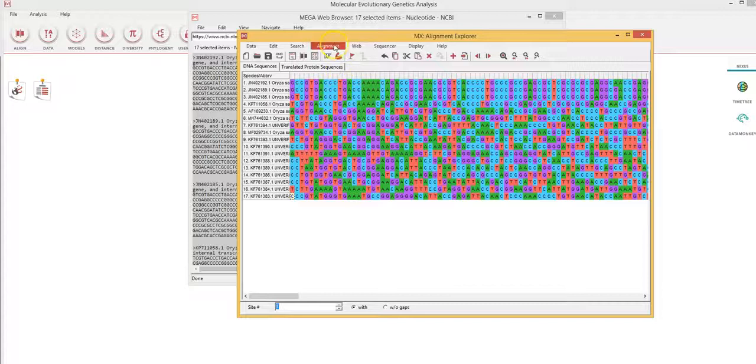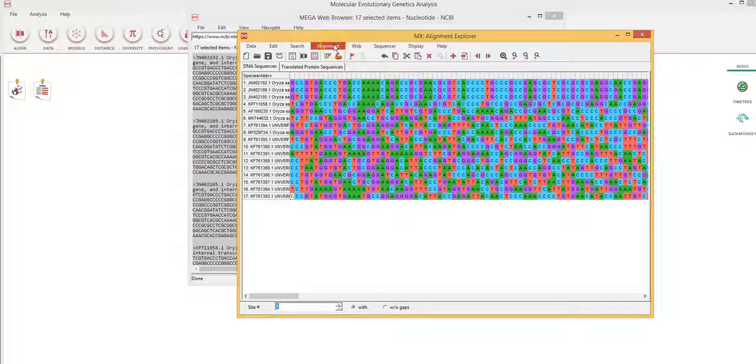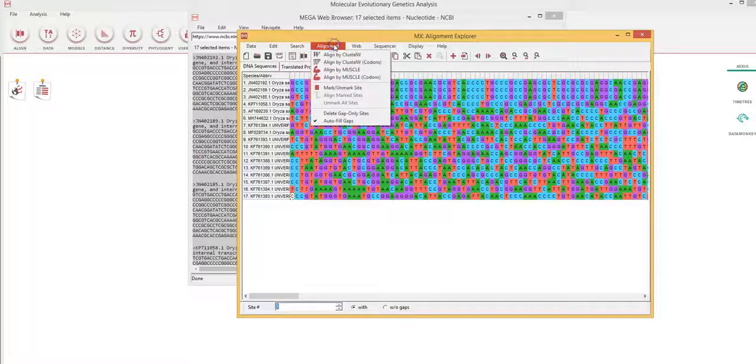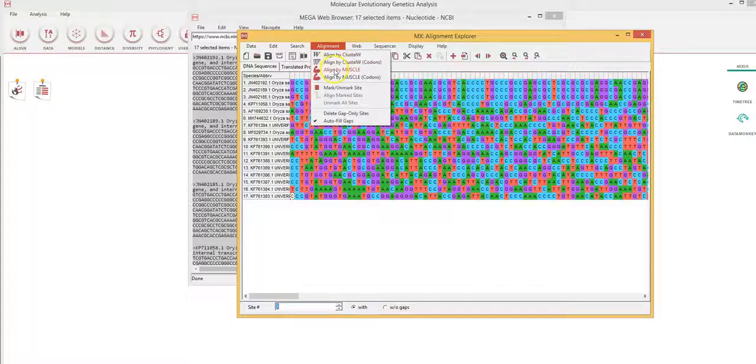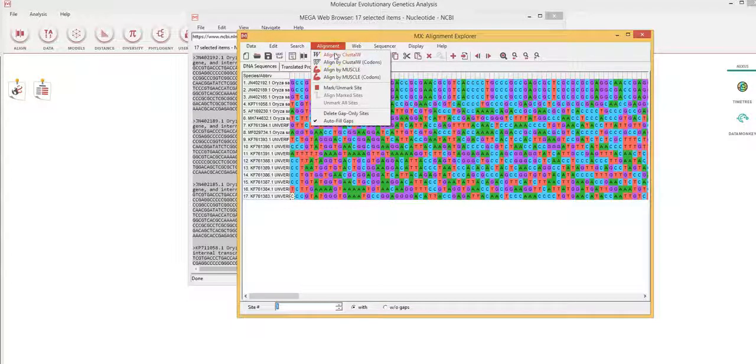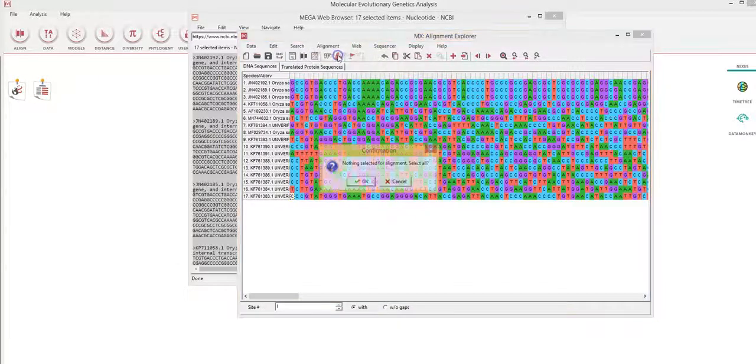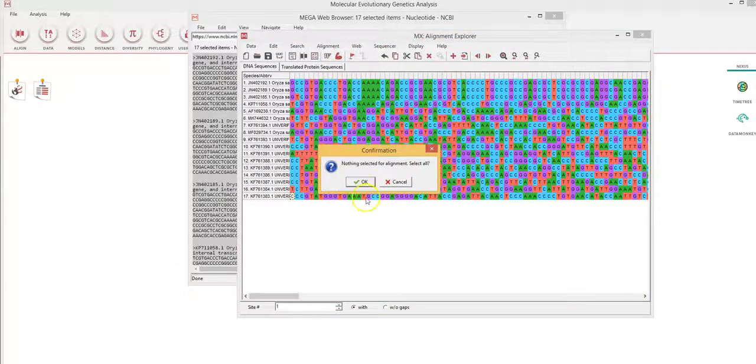Now, when you align, you are offered multiple options in MEGA 10. So you click on alignment and you can align by ClustalW or MUSCLE. So I'll align by ClustalW. And since these are nucleotide sequences, I won't select codons.